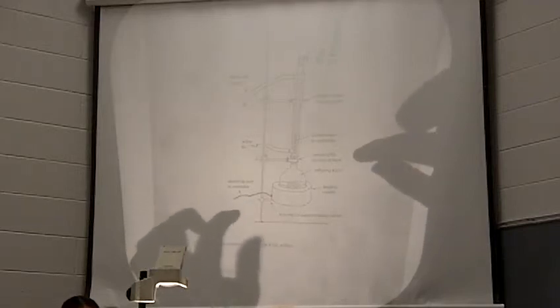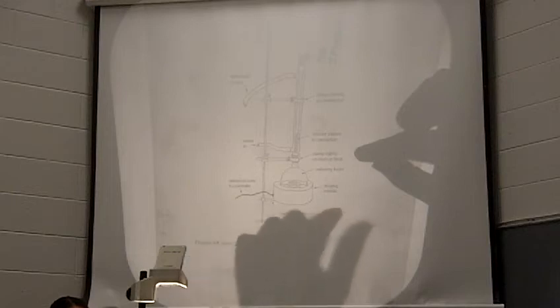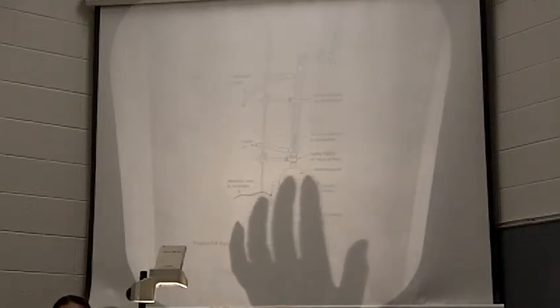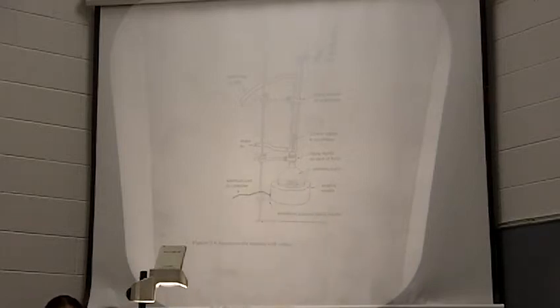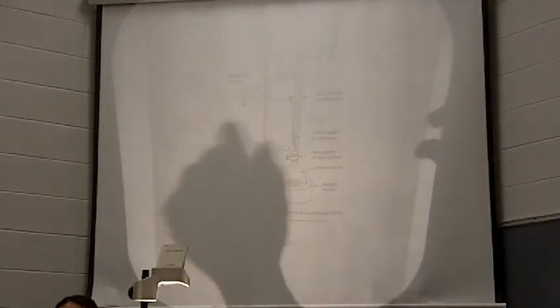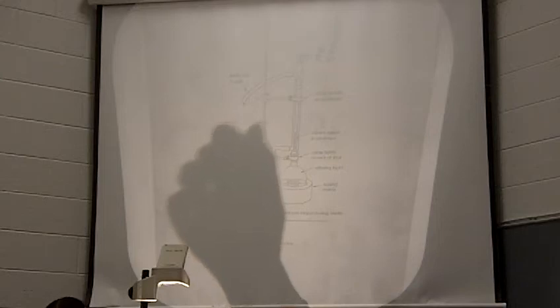Now the ohmite that you're going to plug the heating mantle into is on the opposite side. So it is a little bit of a balancing act, because you've got to have enough length for the cord to get into the ohmite, but then make sure that you get as close to the sink as possible as well, okay? And on your hoods, the plug that has the switch and the dial, we're going to be using those this week, okay?